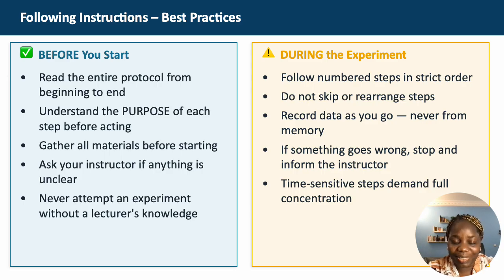So you have prerequisites that you need to know before starting an experiment. Please take the time to read about that. Take the time to do some research before doing an experiment. And now, during the experiment, follow numbered steps in strict order. Don't skip or rearrange the steps.